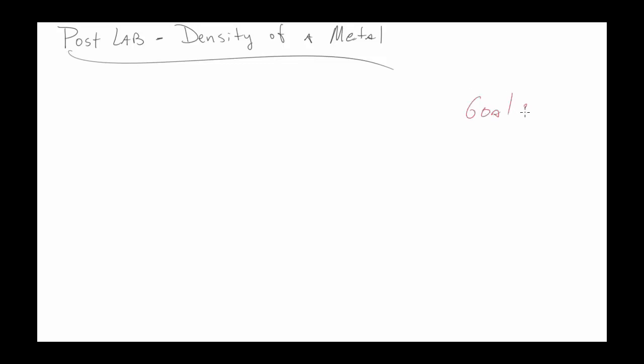And so one of the things that we really wanted to do, and the goal of that lab, even though I know we've measured density and worked with density before in 6th, 7th, and 8th grade, and it keeps kind of popping its head into our classrooms, but it's something that's simple where you don't have to think about what you're measuring or doing, but you can focus on some other techniques that we're trying to get you to learn. And in particular, the goal of all of this was to have confidence and actually record our measurements so that we had confidence in those measurements.